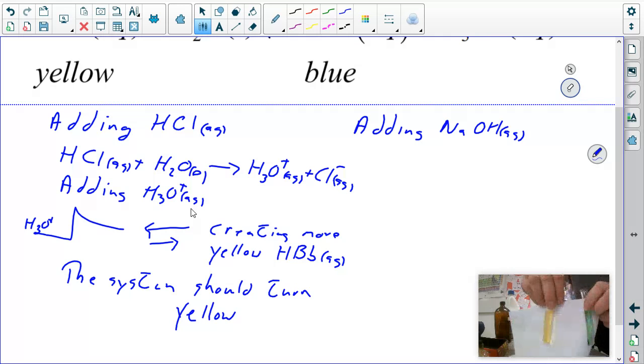Okay, so the one on the right here is definitely much more yellow than the one on the left. There's no green at all on the right-hand side. Again, the prediction turned it yellow.